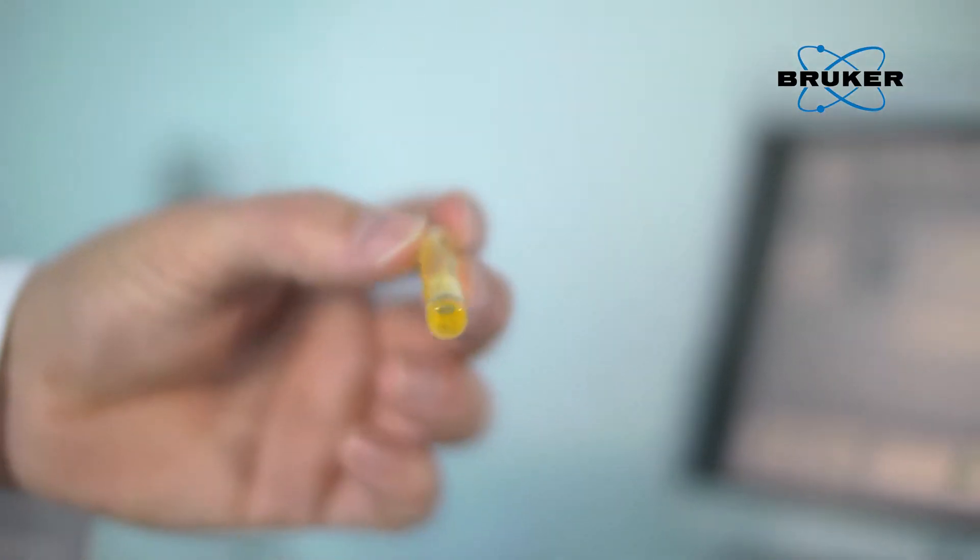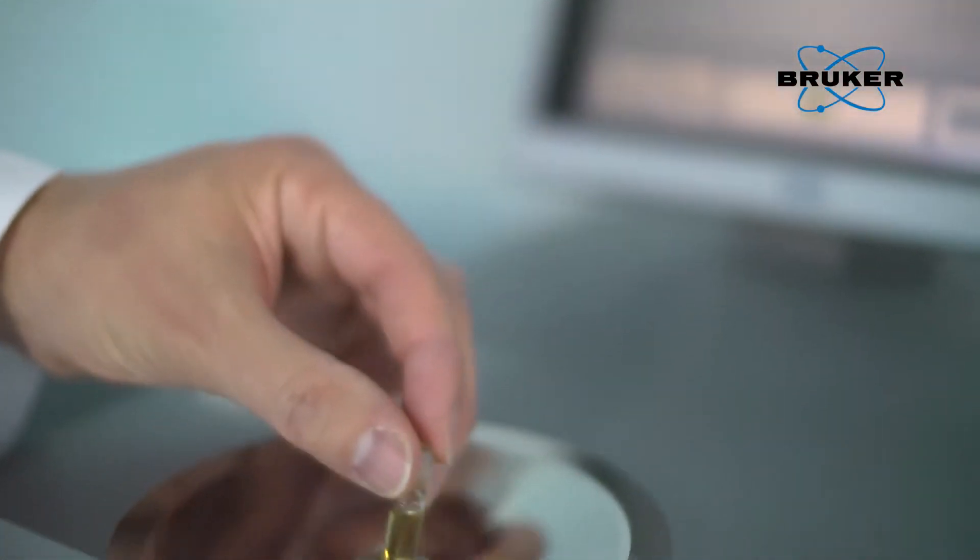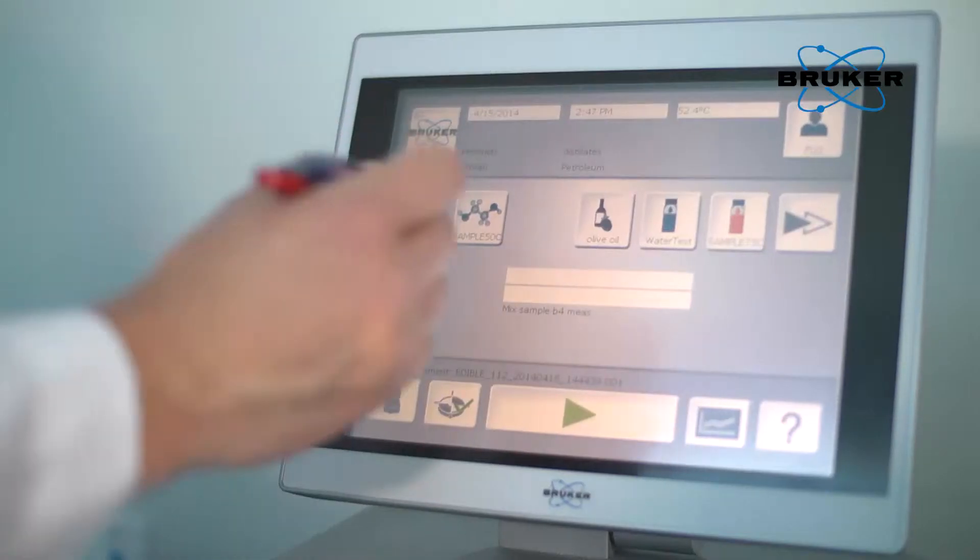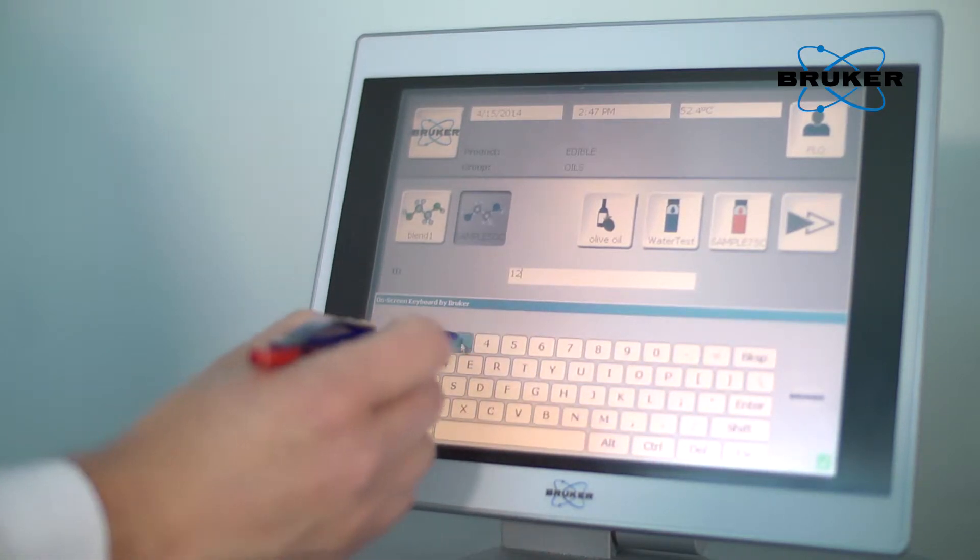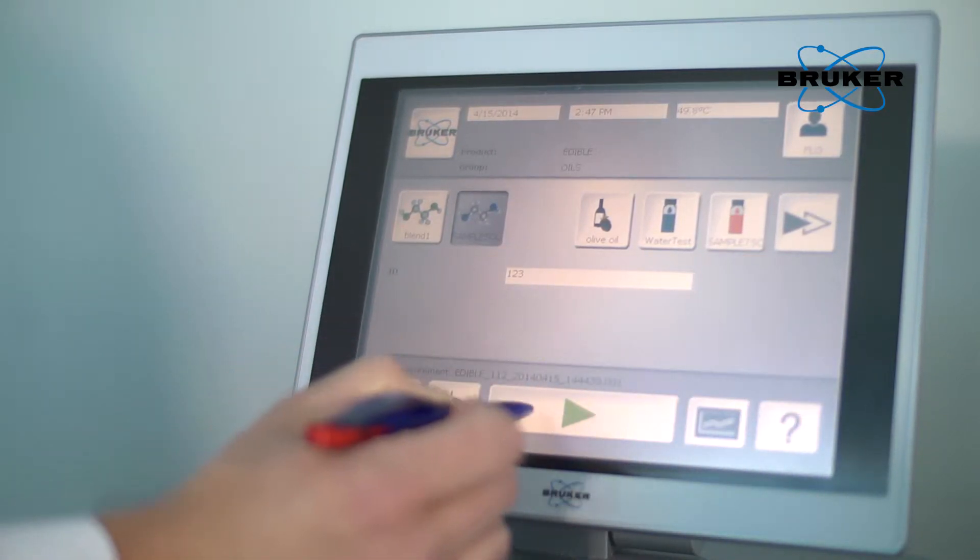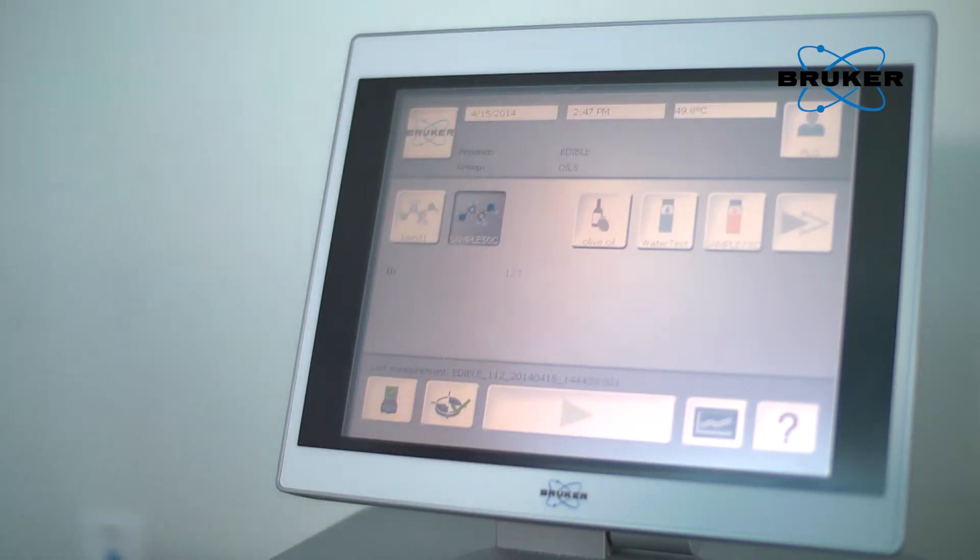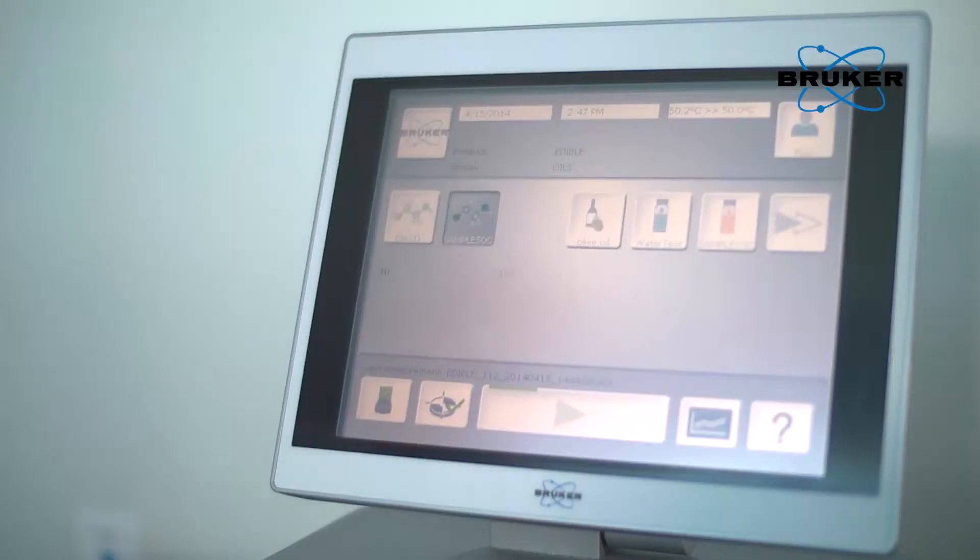The sample is simply filled into the measurement cup or sample vial and placed onto the spectrometer. The product is selected by either pressing on the respective product icon or by using a barcode reader. A simple touch on the screen starts the measurement. The progress is displayed through the green status bar.